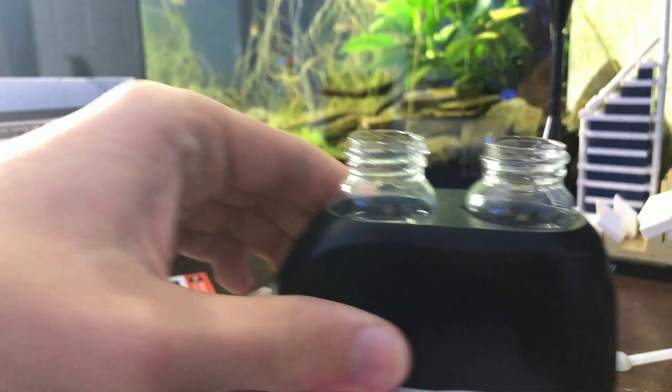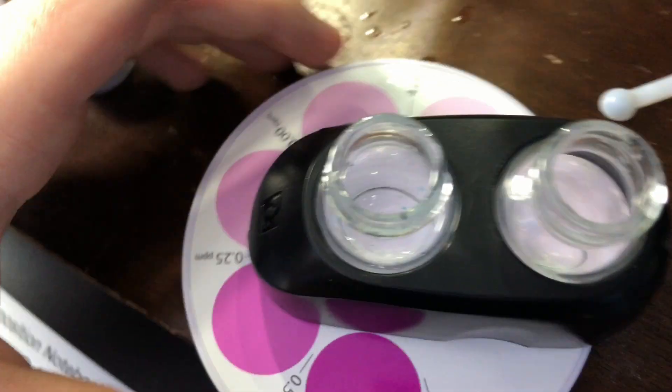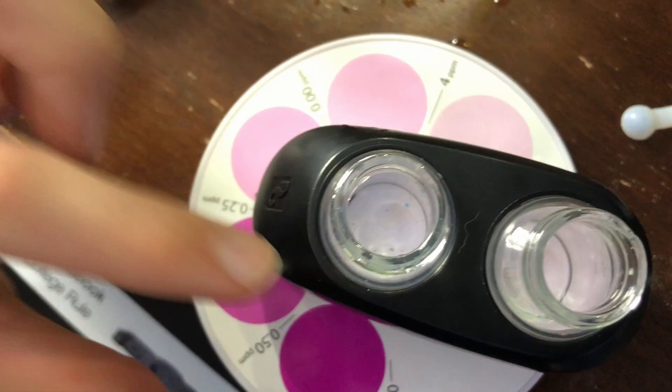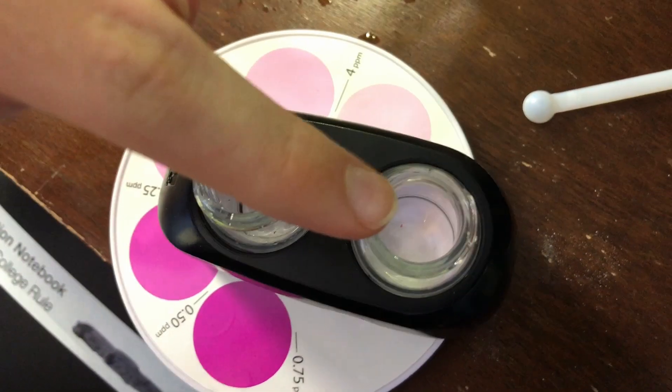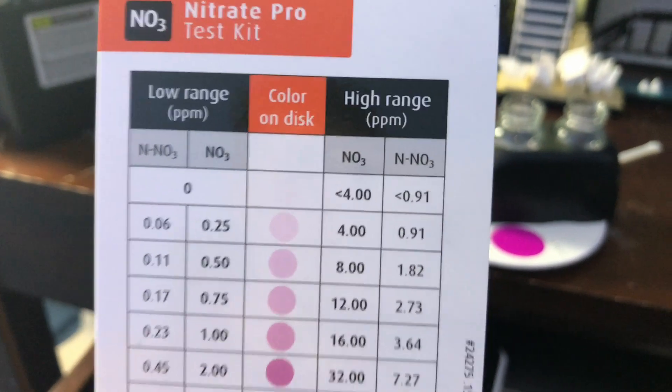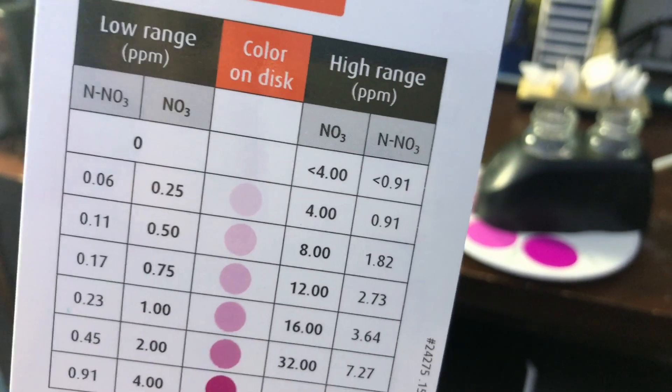You can see — looking at the color differences — this is the reacted water, this is the normal clear water, and it's not really reading anything significant. So I'm going to put that right about on the high range scale. It's probably less than 4 ppm — it's got a little bit of a tint, probably right around 4 ppm, maybe a little bit less, maybe like 3.5 ppm. Which is good. Really, the only thing causing the algae is that it's using up the nitrates that are in the tank, and that's why the nitrates are lower.